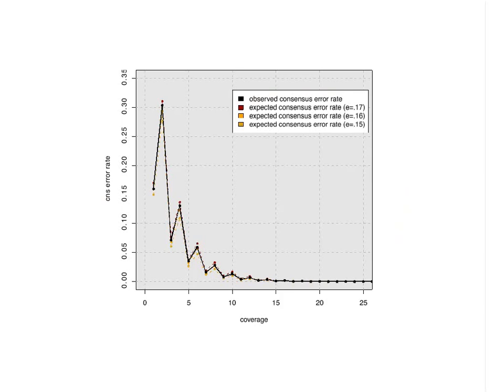In cases where the coverage is biased but it's low, but not zero, the pipeline works fine on that. It doesn't seem to be terribly affected by what the coverage variations in the Illumina or the 454 data look like. So if you have lower coverage in some regions, that'll be projected onto the PacBio reads, and the result of that region will be depth in whatever the PacBio depth was originally.